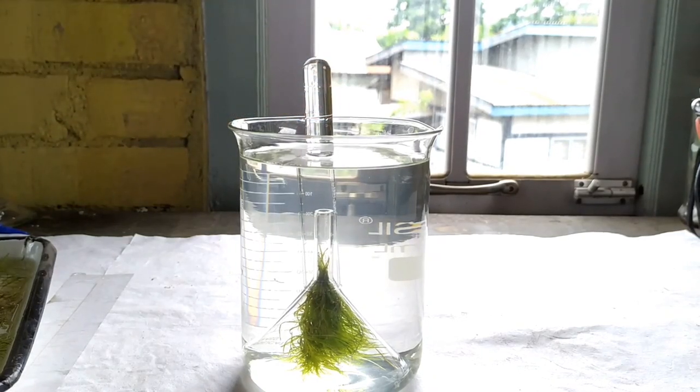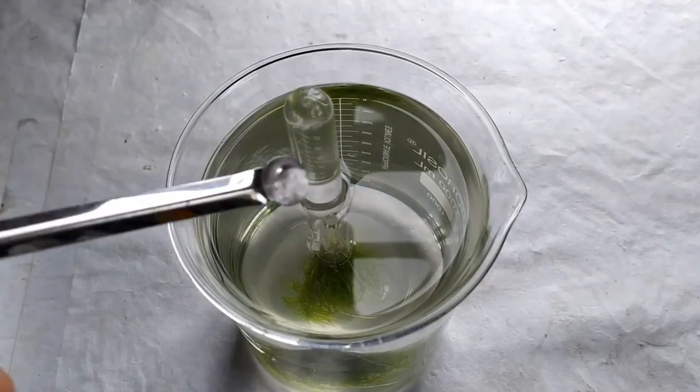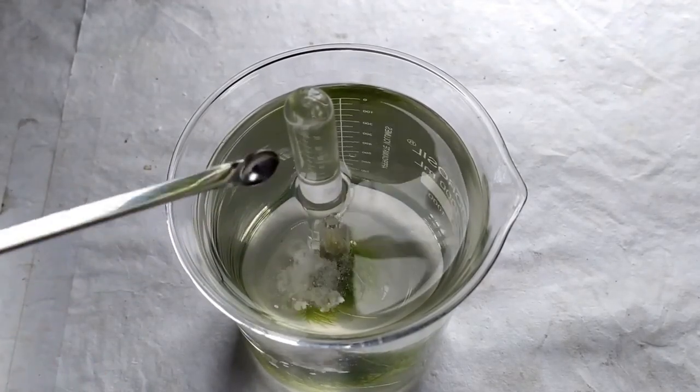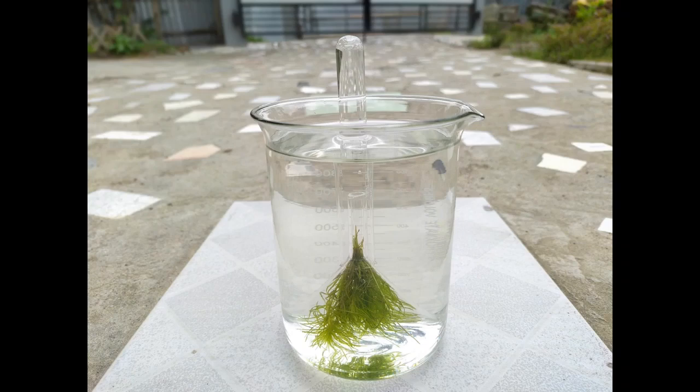The setup is now complete. You may also add a pinch of sodium or potassium bicarbonate into the beaker to kickstart the photosynthesis process. Place the setup in sunlight.